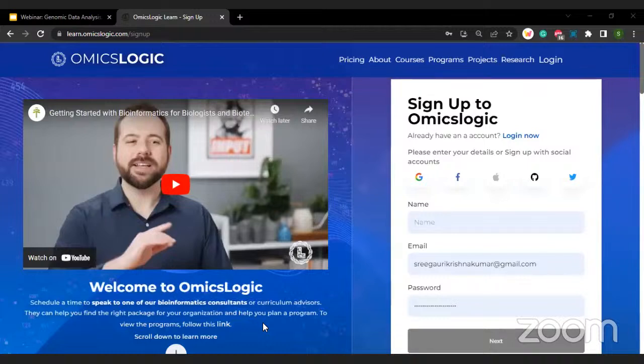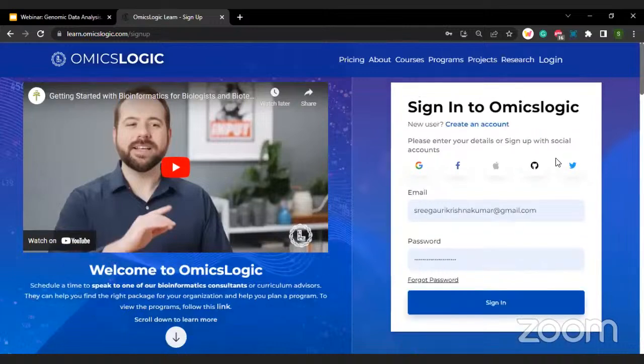All right, I've got a few yeses, so now I'm going to log in since I already have an account on the portal.